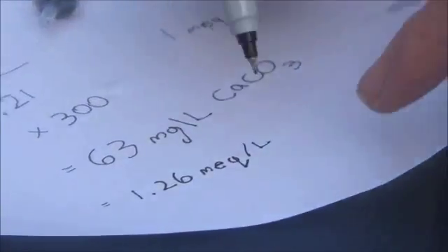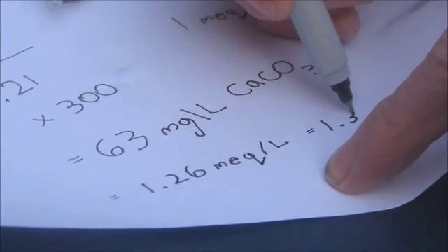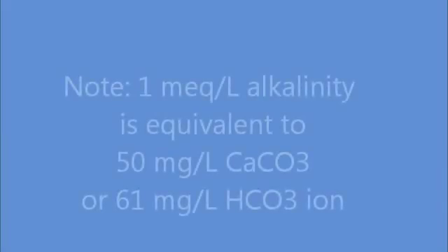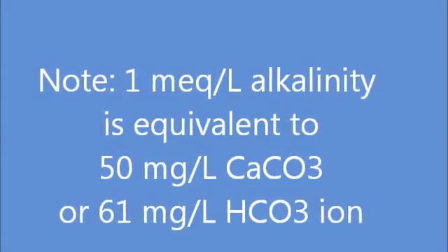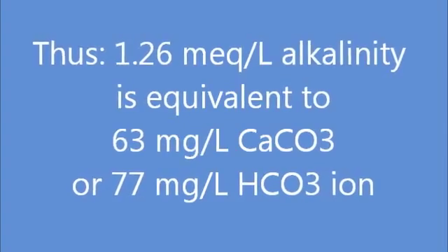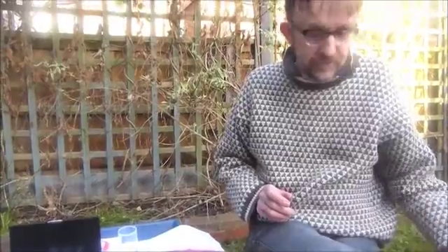And because this isn't very accurate, I probably would simply say 1.3 milliequivalents per litre. So that's our result for how much bicarbonate there is in the solution: 1.3 milliequivalents per litre of alkalinity. That's quite a small amount of alkalinity.